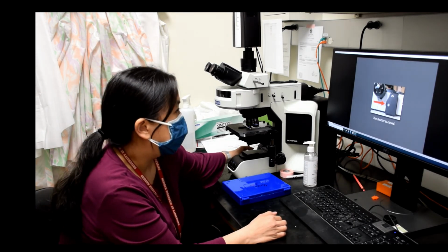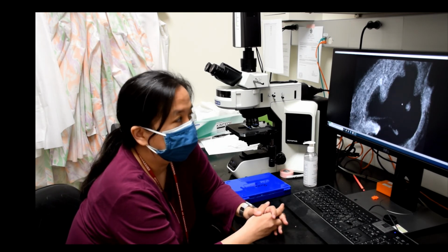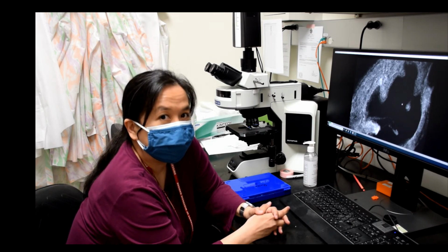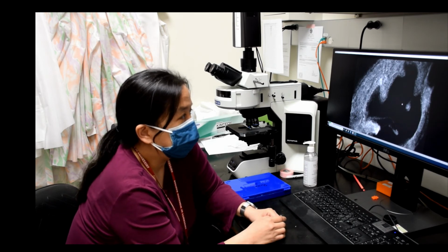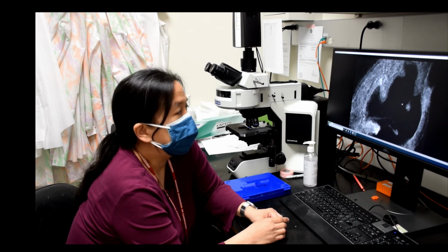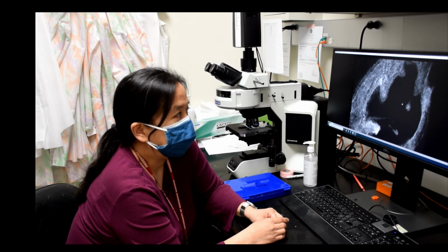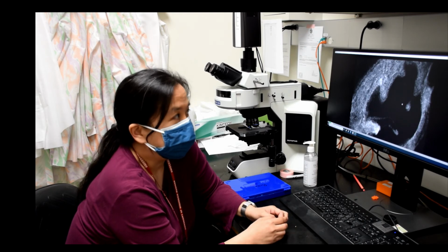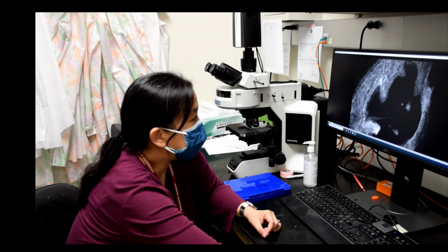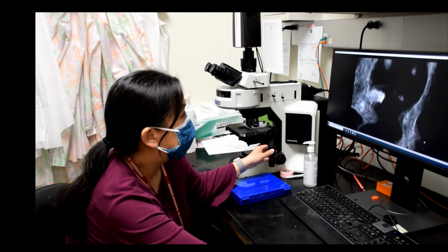So what we have here on the microscope right now is just one of the colors that we can visualize under the scope. Right now we're looking at the staining for the nuclei in the cells, and that's what you're seeing here. When you first look at it under the microscope, it will look like a black and white image, and then once we finish taking the picture of all of the different channels, the software has a way to pseudo-color everything. So in general, your nuclei are going to look blue, and then we can decide what other colors the different proteins are in the cell.